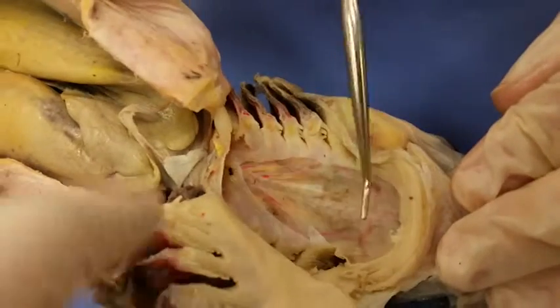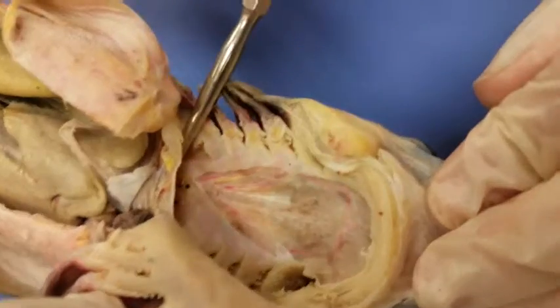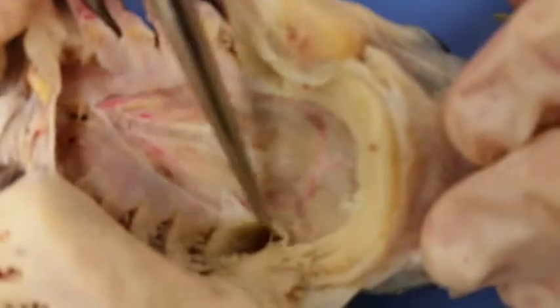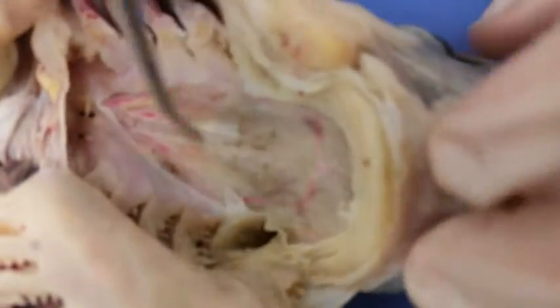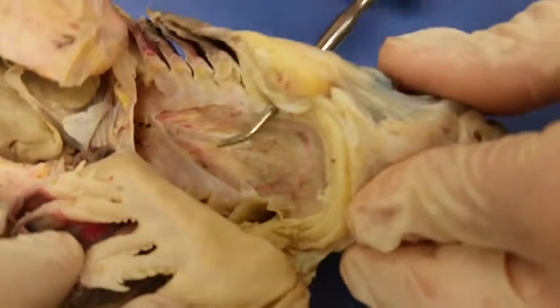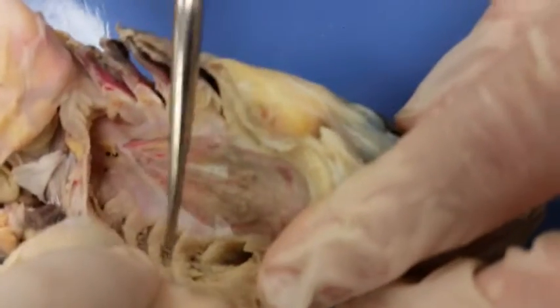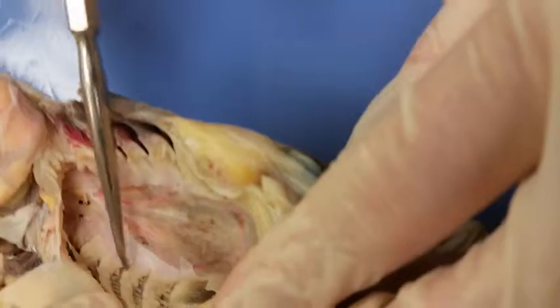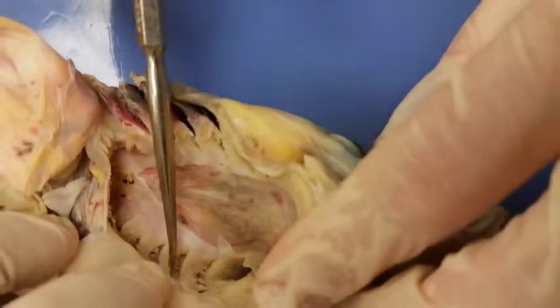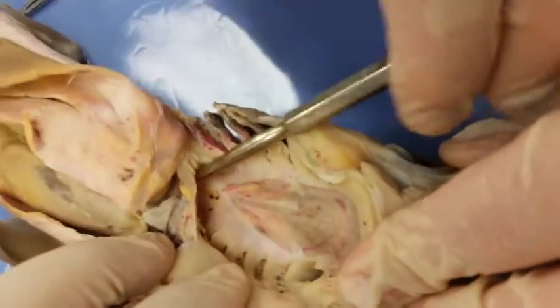We have the oral cavity, quite obviously, leading down into the pharynx. We have right here, this hole is the spiracle, the inside of the spiracle, which can be seen from the exterior also. Right there, there's a spiracle, and that leads in like that. Then internal gill slits, very obvious, easy to see, along with the small gill rakers within the gill slits, the small kind of finger-like projections. We have that leading back into the esophagus back there.